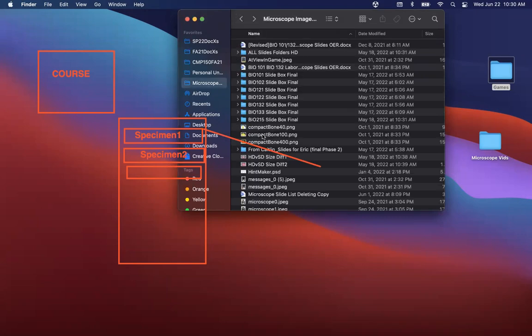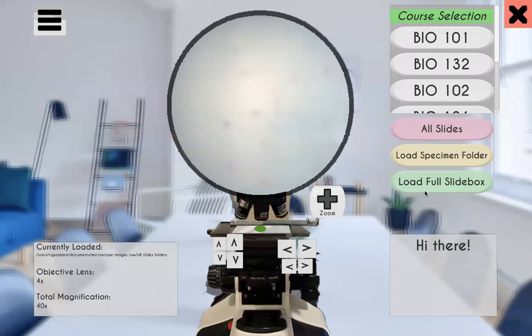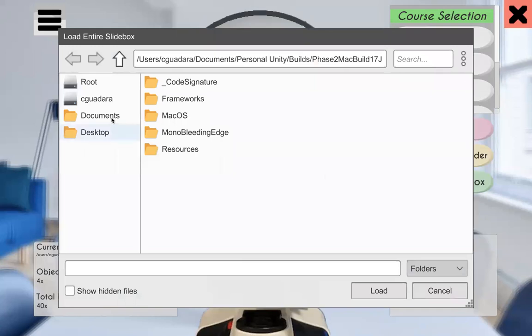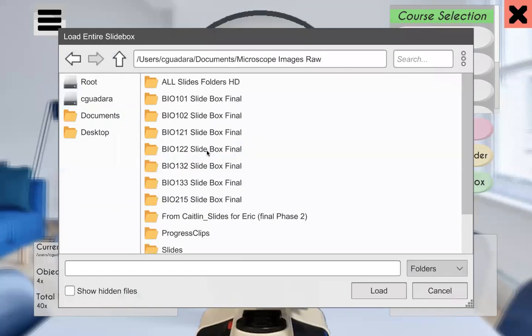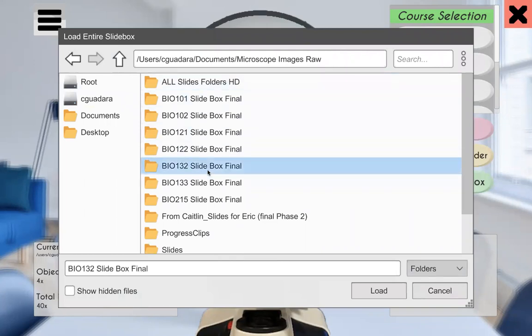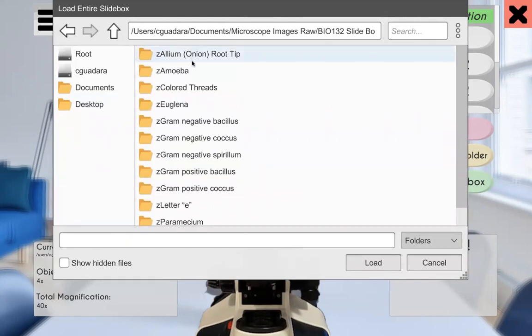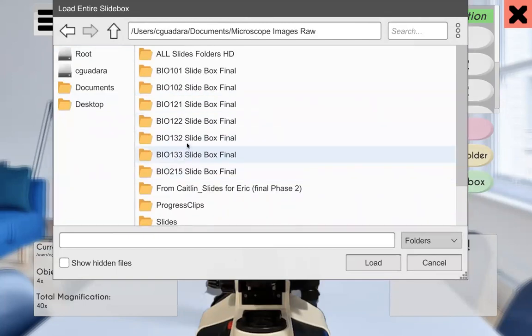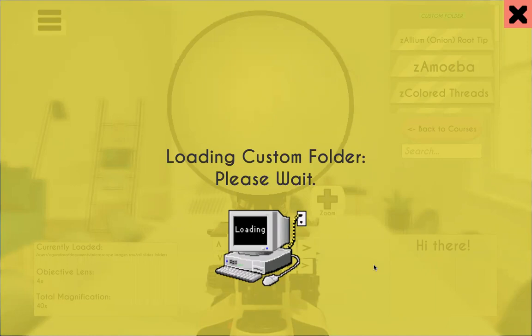So what I'm going to do is I'm going to load slide box, and I'll clear my annotations here, load full slide box. I will navigate to microscope images, and we'll choose 132. Now, this will have a delay because the program needs to create an image for every image it finds inside of this folder. And again, we do not want to choose any of these folders inside of the course folder. We click load. We'll have to wait for anywhere from 10 to 20 seconds as it is going through each specimen.